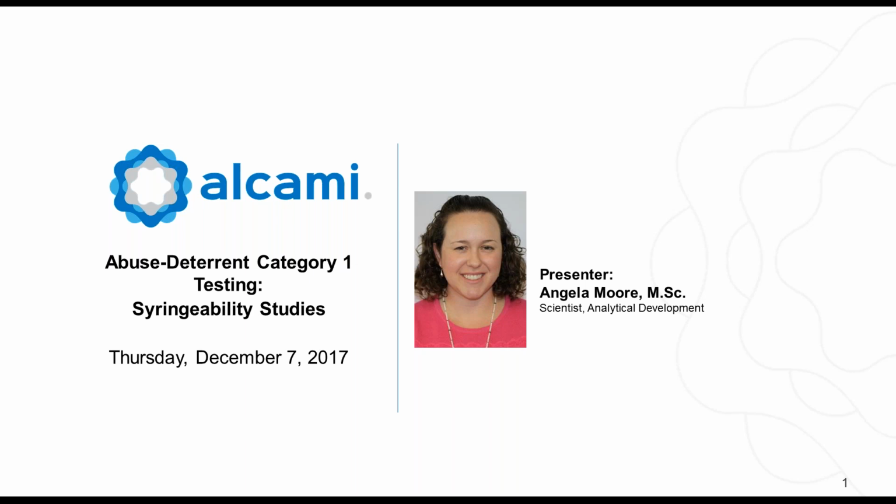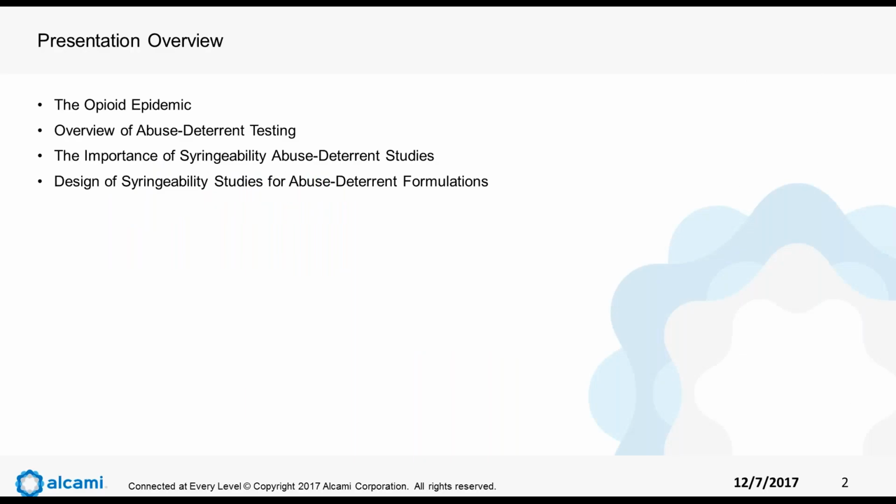Thank you, Courtney. Hi, my name is Angela Moore. I'm a scientist here at Alcami in the Analytical Development Department, and I perform the Category 1 testing along with designing studies for Category 1 testing of abuse-deterrent products. So today we're going to talk about abuse-deterrent Category 1 testing, and we're going to specifically focus on syringeability studies.